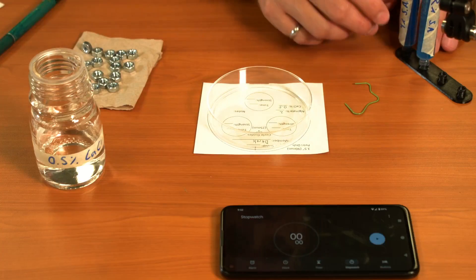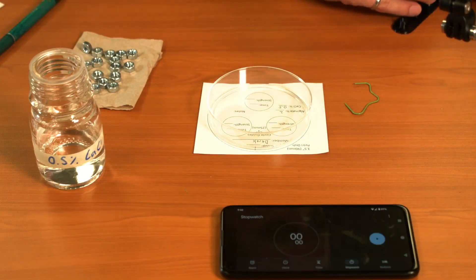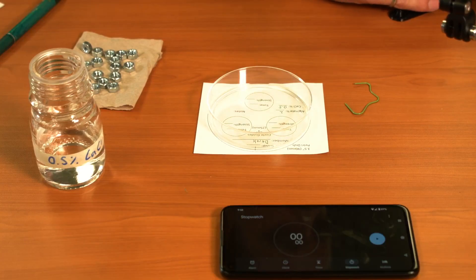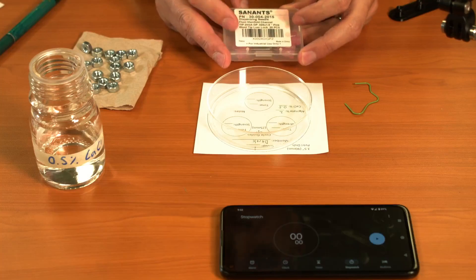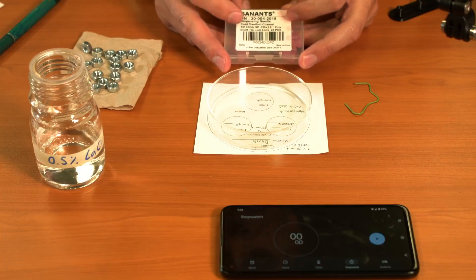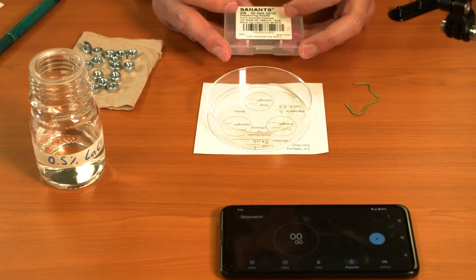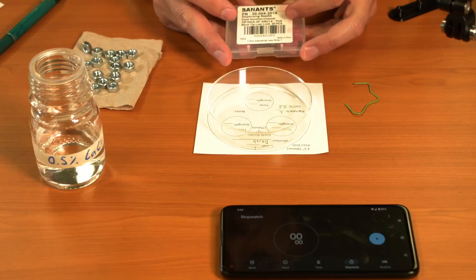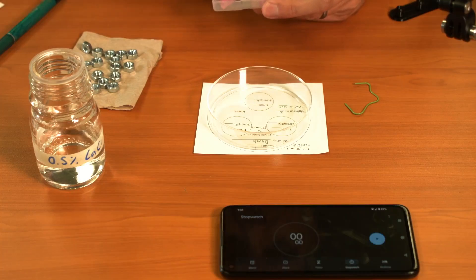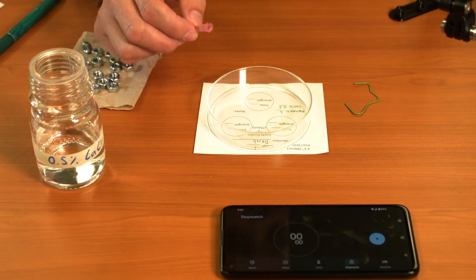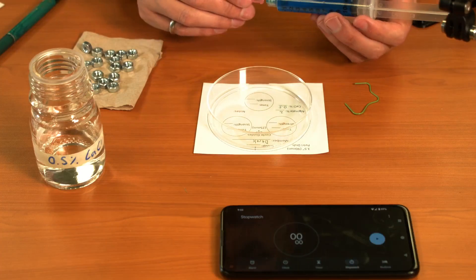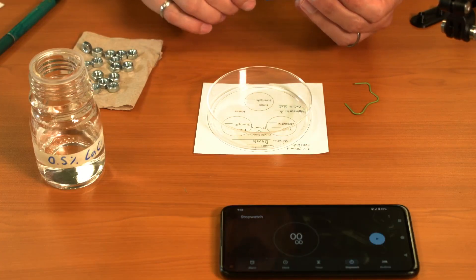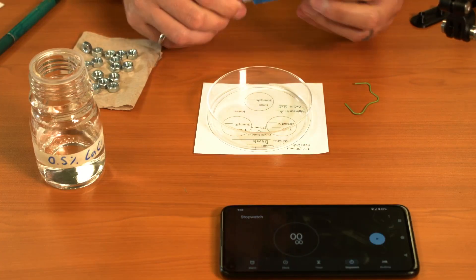I'm going to take my sodium alginate and put a dispensing tip. This is like a needle, except it doesn't have a point. It's got a blunt point needle. This one is a 20 gauge needle, and it has a lure lock on that so it will screw onto the end of my syringe.